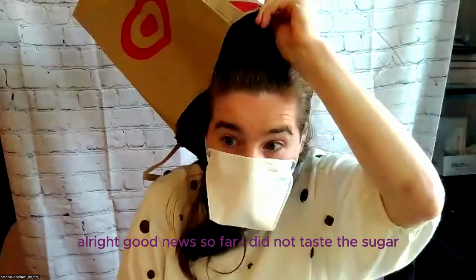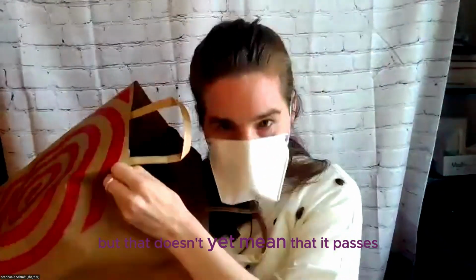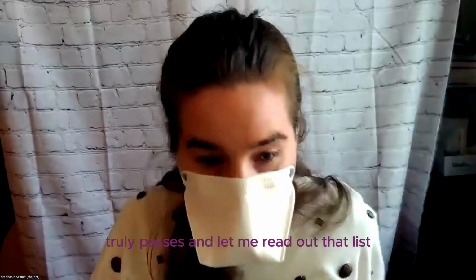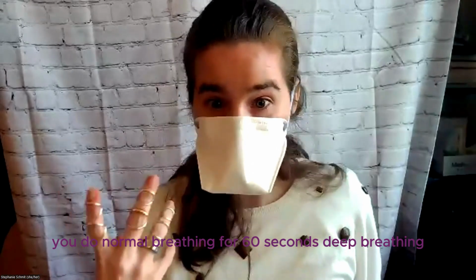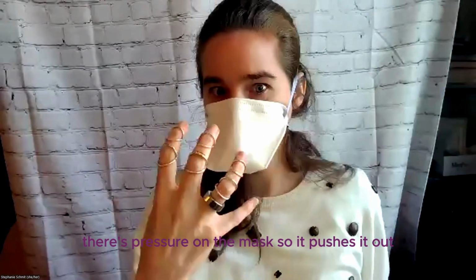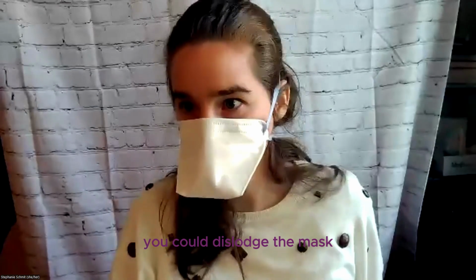All right, good news so far. I did not taste the sugar, but that doesn't yet mean that it passes. You have to do a lot of stuff to make sure it really truly passes. And let me read out that list. You do normal breathing for 60 seconds, then deep breathing. So you want to breathe in and out forcefully, because as you breathe out, there's pressure on the mask, so it pushes it out. So when you're breathing out really hard, you could dislodge the mask.